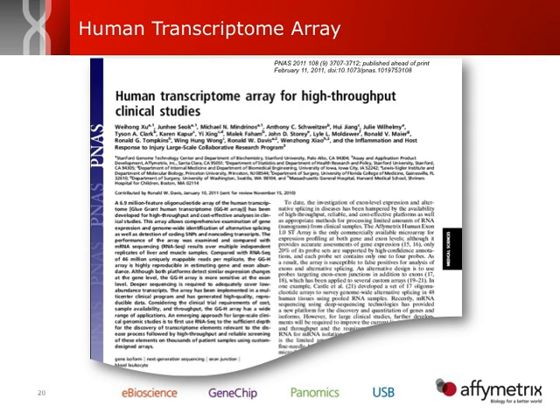Okay, so now let's start talking more specifically about the Human Transcriptome Array. The current version that's commercialized by Affymetrix is an offshoot of a version that was designed by Ron Davis in Stanford, California. This paper was published in PNAS in 2011, and we'd be happy to send you a link to download it. I encourage you to read it. This is the HTA version 1, the first version of the Human Transcriptome Array.